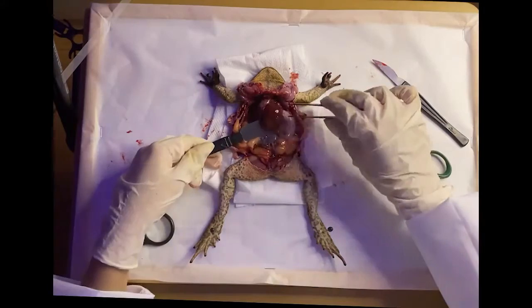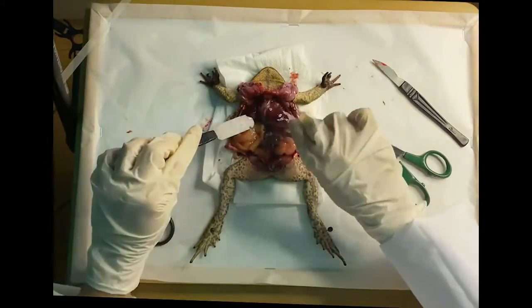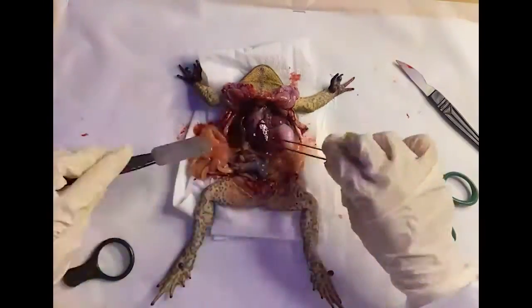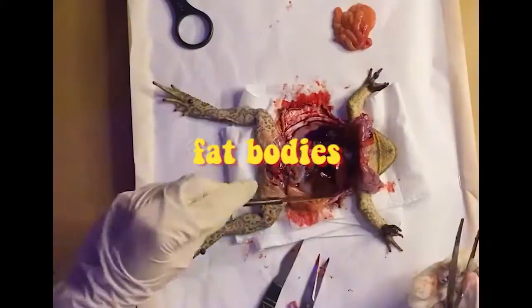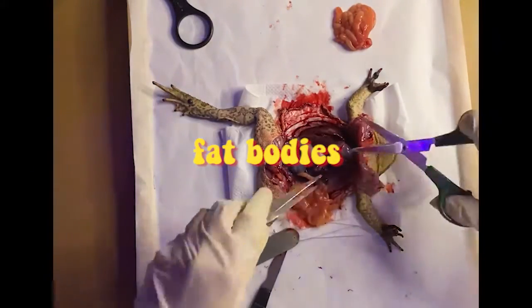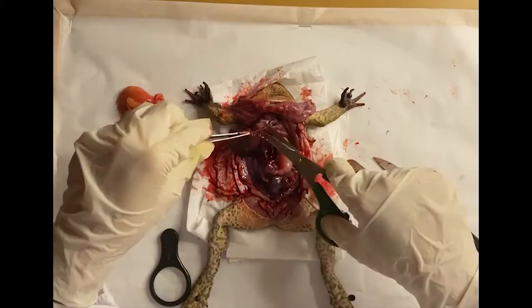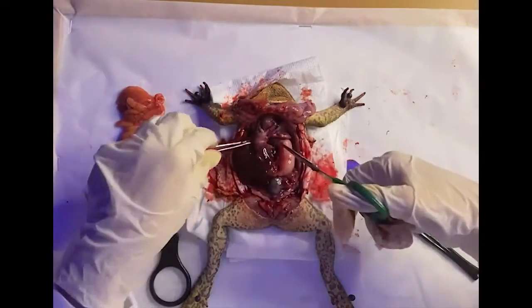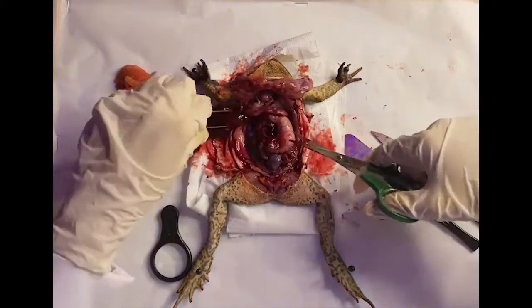So for now, I will be exploring and trying to identify the organs. This bluish-black round organ is the spleen. Now, I am separating the fat bodies from the frog. Next, I am cutting off the frog's liver. Here is the second lobe.